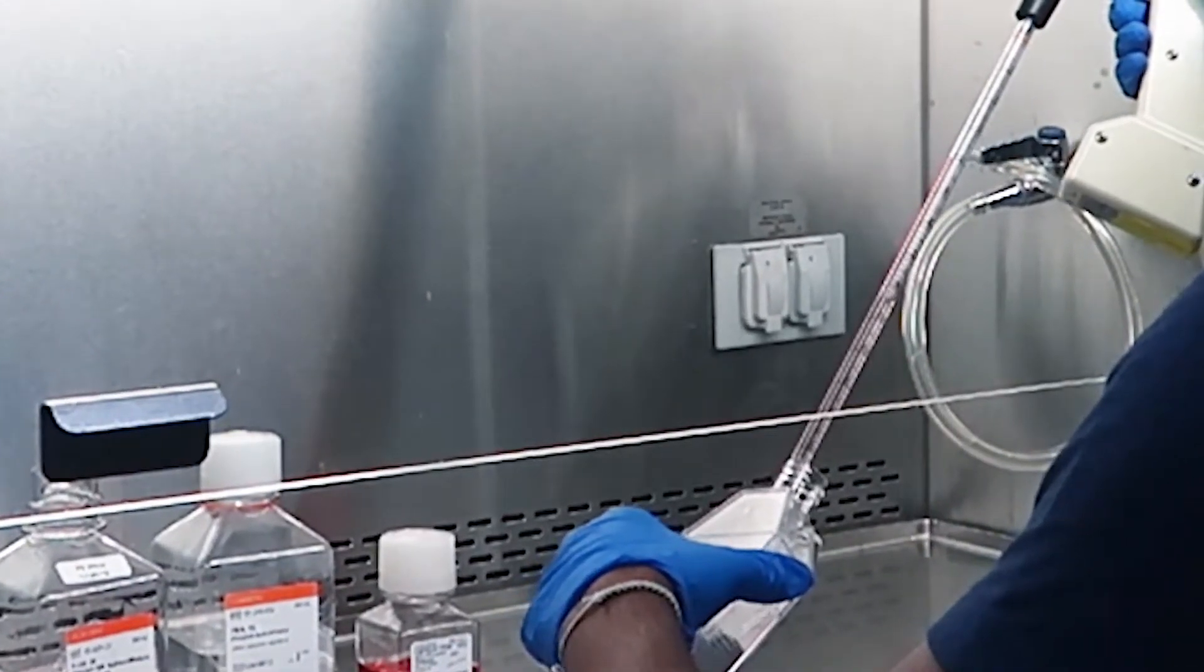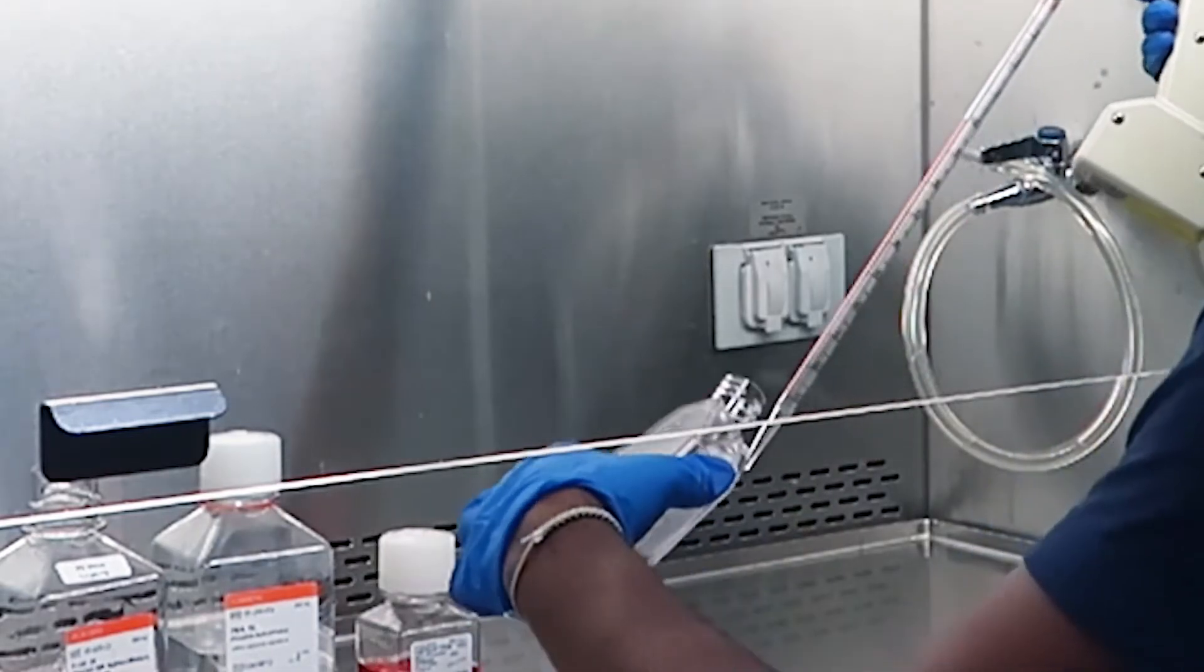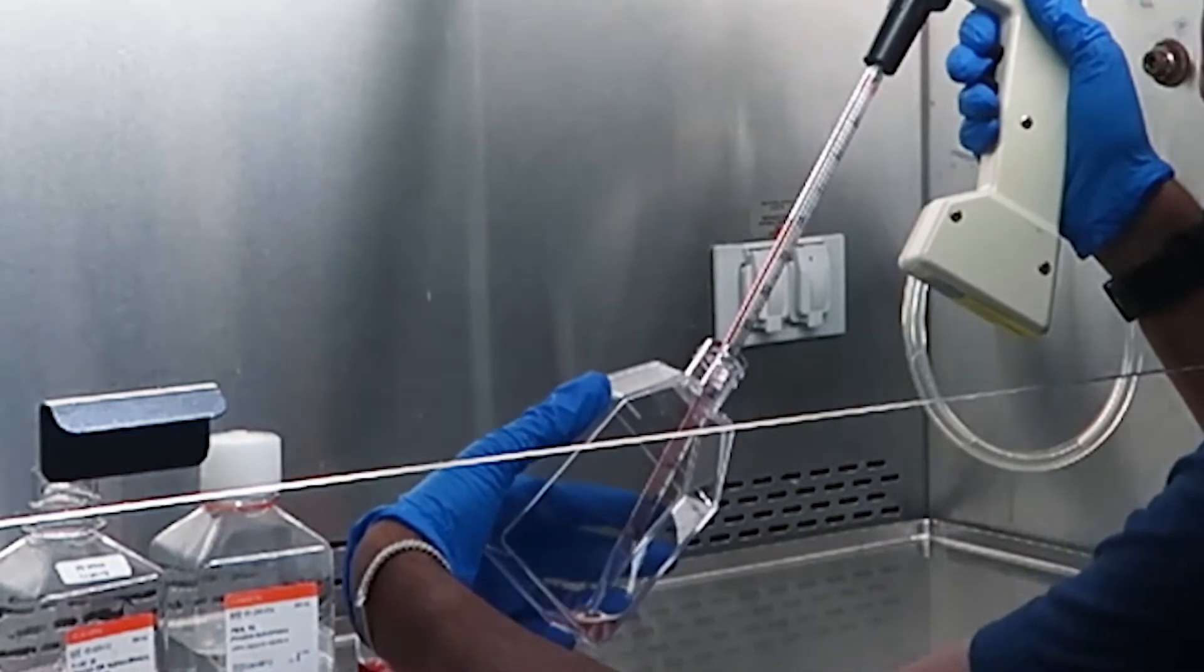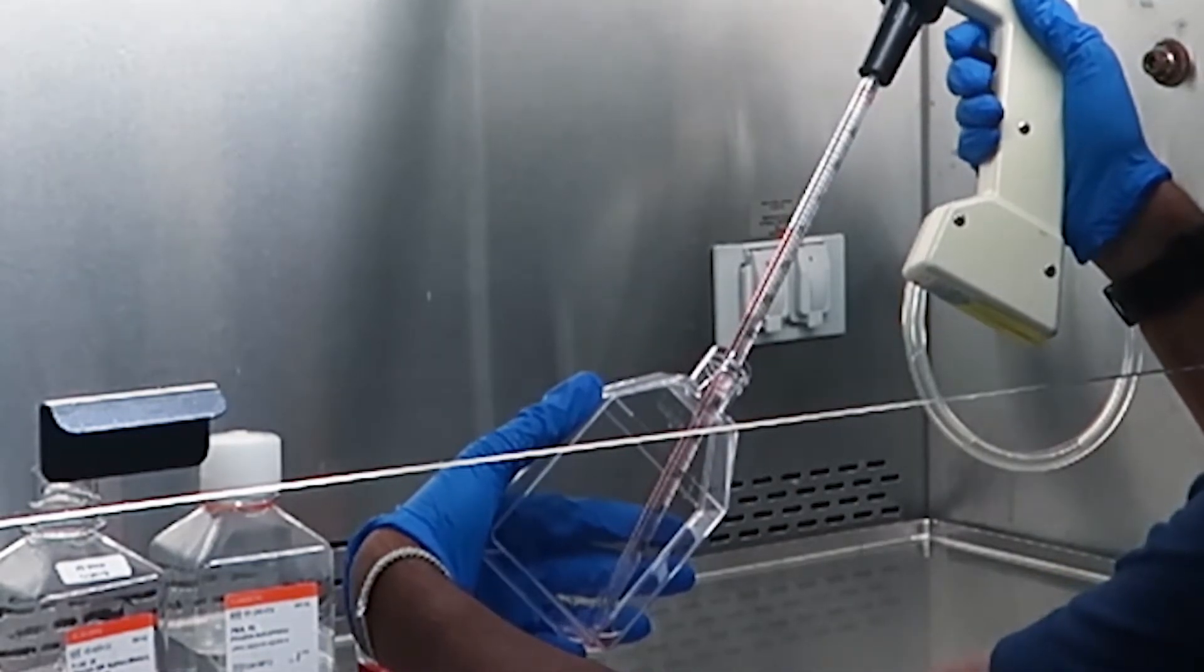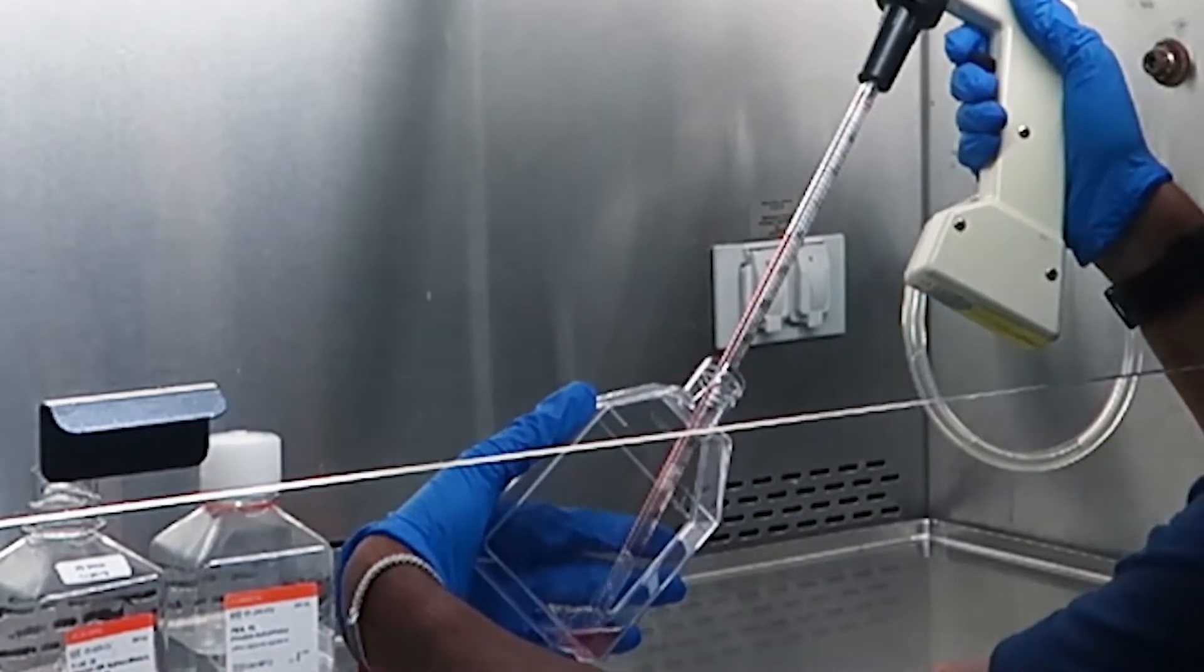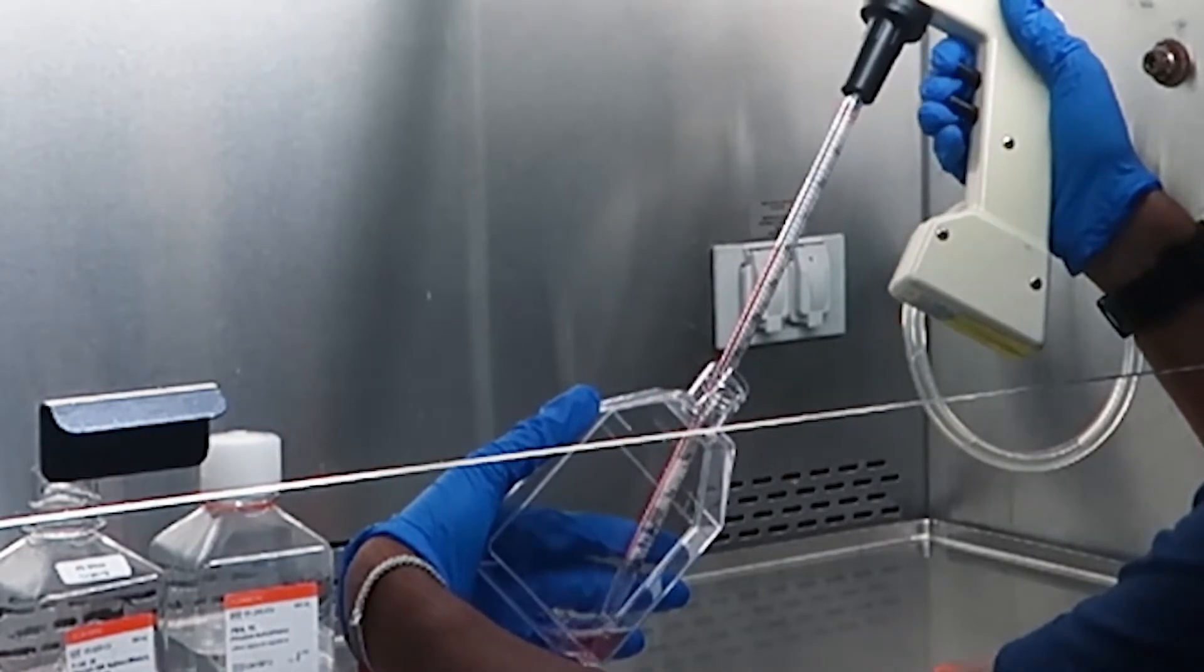Once you add your medium to the flask with trypsin EDTA, you want to rest your pipette at the bottom corner and tilt your flask. At this point, you want to repeatedly pipette the medium up and down. These cells were formerly in a cell monolayer. So you want to disperse the cells into a single cell suspension, which allows for accurate cell counting and uniform growth.